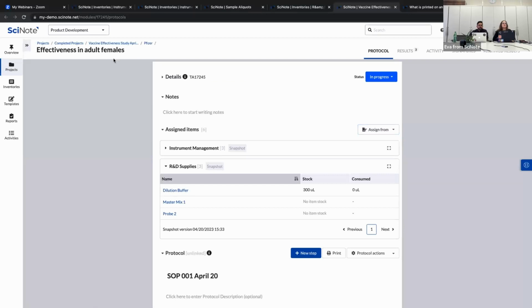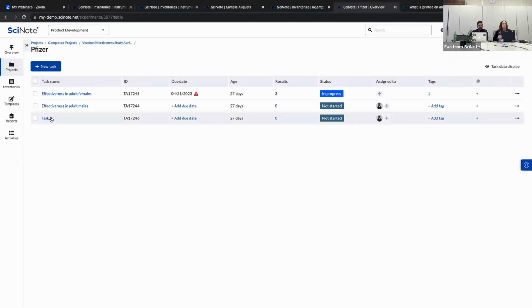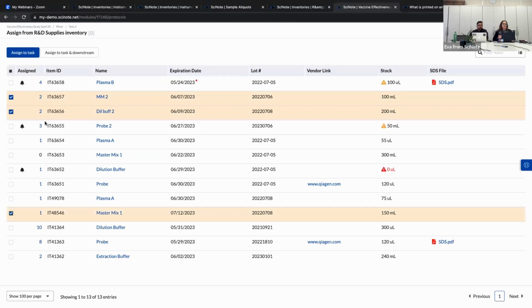All right, sorry, let me try with a different task. Okay, so I'll come back here, assign R&D supplies. Pick a handful of items here.